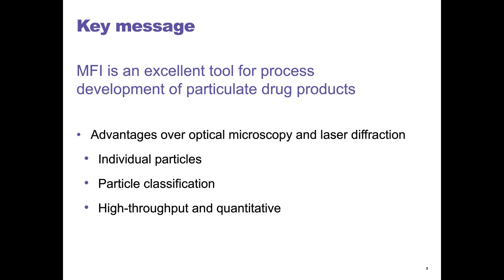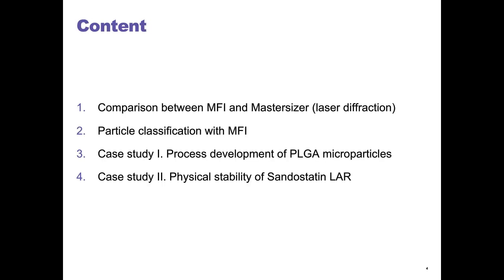I will start with showing you a unique side-by-side comparison between MFI and Mastersizer, which is a laser diffraction instrument, for two commercial PLGA microparticle products, namely Risperdal Consta and Sandostatin LAR. Secondly, I will show you how we perform particle classification with the help of the MFI software. And finally, I will show you two case studies of how MFI can be applied in the pharmaceutical development of PLGA microparticles. The first case study is about the process development of PLGA microparticles, and the second case study is about the physical stability of Sandostatin LAR after reconstitution.